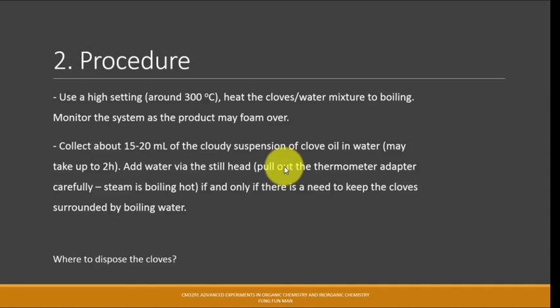It might take up to 2 hours, but it could be as short as half an hour, or if you're lucky, or you may call unlucky, split second, maybe 15 minutes. You just have to observe. You can't depend on what we tell you, because the conditions will change. The temperature changes, the atmosphere varies a bit, and our skills are different, okay?